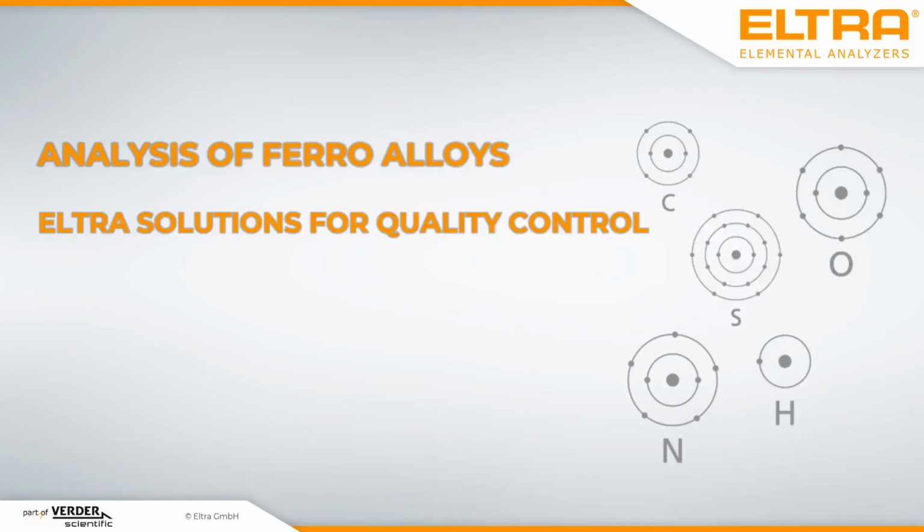Today we will focus on the carbon-sulfur and oxygen-nitrogen analysis of ferroalloys. In the following we will shortly discuss which properties ferroalloys have and which things are important for a correct elemental analysis.